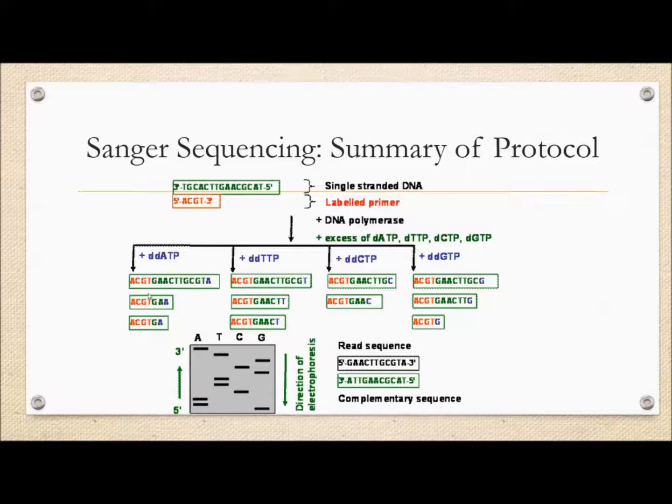And so what happens is, as this begins to build up, the moment you have an A, because this is the dideoxy, it prevents further reaction. So wherever there's an A, when you look at these fragments, you'll realize that termination occurs wherever there's an A. So you know exactly what the rest of the fragment is because you know exactly how it ends. For example, wherever you have a ddTTP, your chains will terminate in a T. And so these are the different fragments that you're building up.